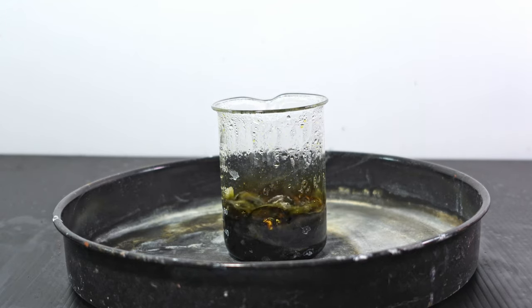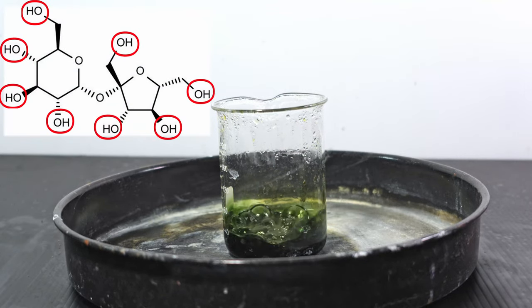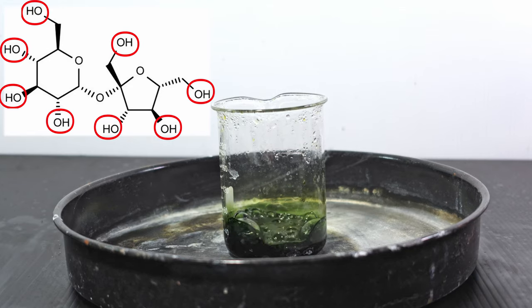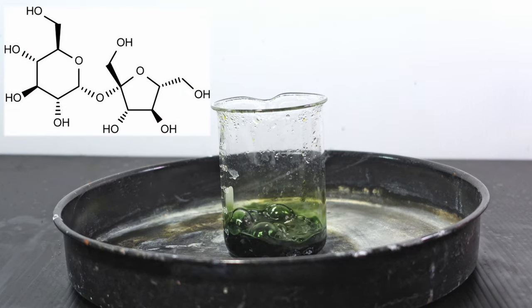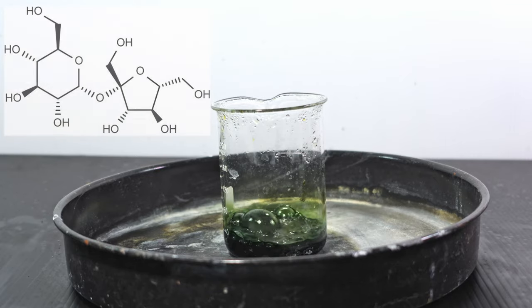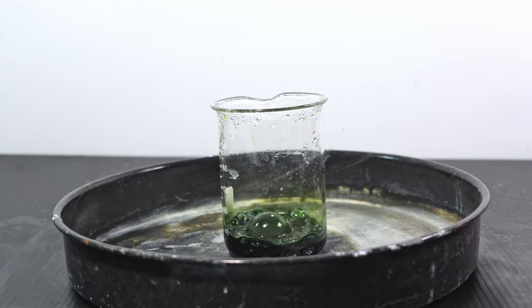The reason for this is that the sucrose molecule is full of hydroxyl groups. This makes the molecule ripe for oxidation. In fact, it is like a buffet for chromic acid, so much so that all the chromic acid is reduced to chromium-3, as indicated by the green color of the solution.